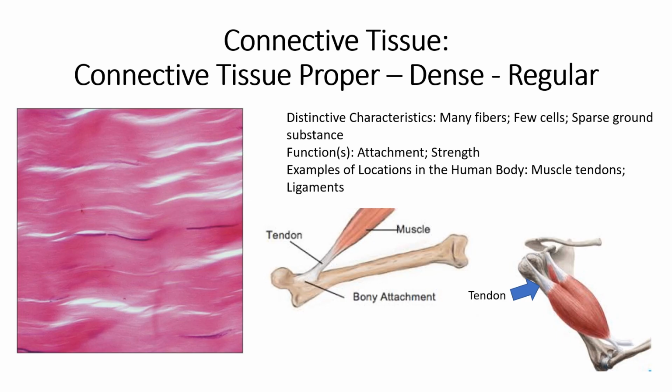So again, we have to think about those three elements: ground substance, fibers, and cells. If we look at this image, if we're thinking about ground substance as being white or light coloration, right? Whatever the predominant stain color is, if it's a light pink, or if it's blue, but there's a light blue in the background, that's your ground substance. Or if it's white, that's your ground substance. So in this image, we see some white, not a lot.